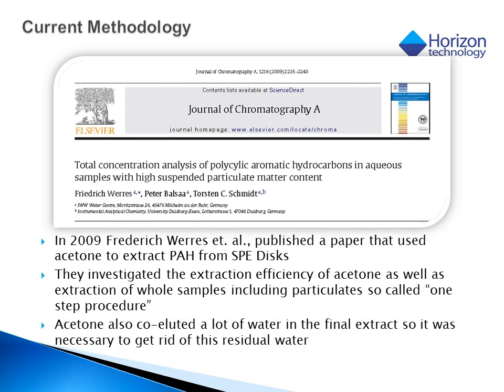The group was able to generate a method that worked very well. However, given acetone's hydrophilic nature, it also extracted a lot of residual water into the final extract. It was necessary to treat their extracts because of this with large amounts of sodium sulfate to dry their samples prior to analysis.